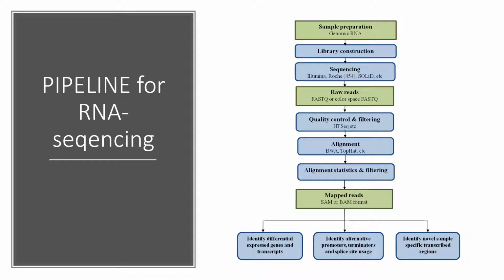Here for my study I have used chromosome 6. The alignment was done using the tool BWA, the result of the alignment was in the form of .sam files, and these .sam files are then converted to .bam files, which are used for further analysis.